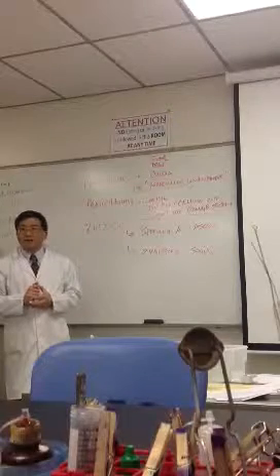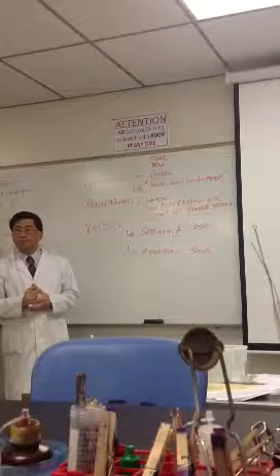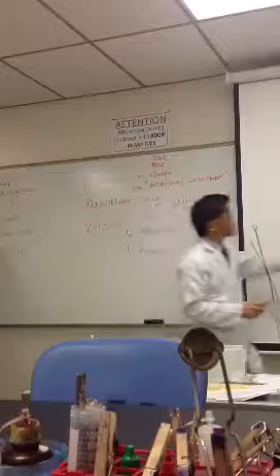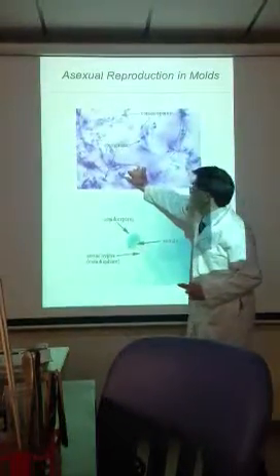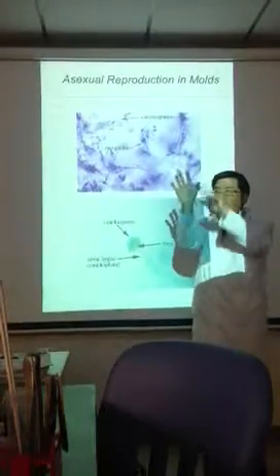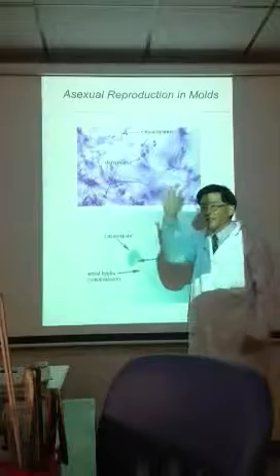I just want to know, what do you want to measure on the Penicillium? Like, so the length, so what you want to measure is this length here, from here to here, okay? So just like the length of your hand, right? Imagine your hand from here to here, okay?